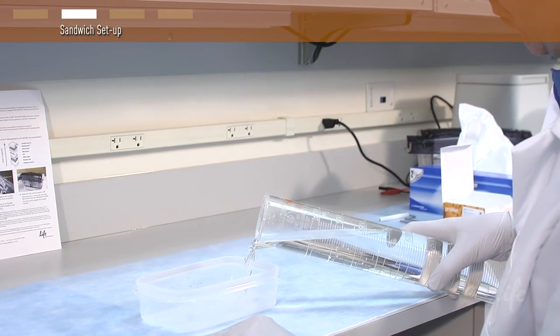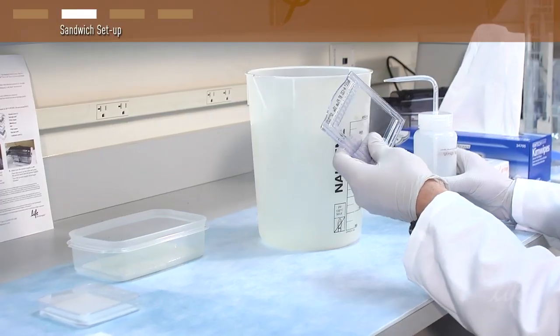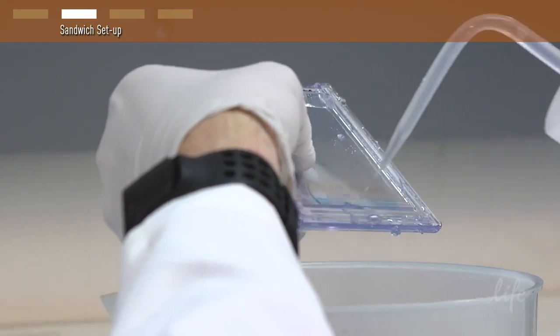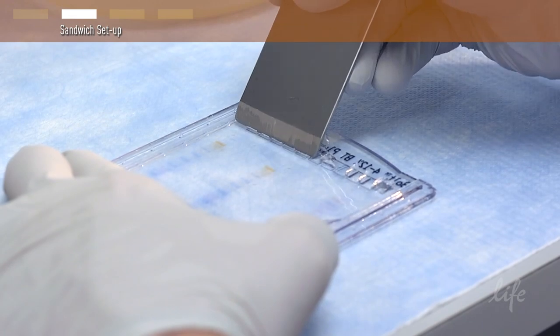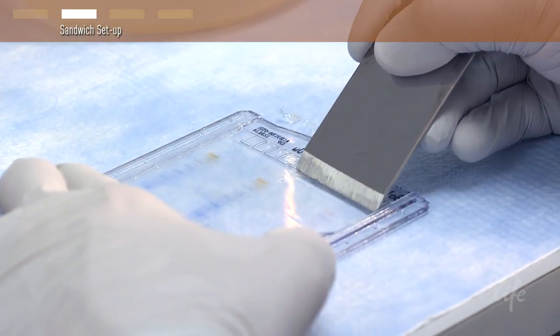Soak two sponge pads in 1x transfer buffer and squeeze the pads to remove air bubbles. Prepare the gel for transfer by first rinsing the gel cassette with water. Open the gel cassette using a gel knife. Carefully remove the wells and the foot of the gel using the gel knife so that the entire gel is of equal thickness.